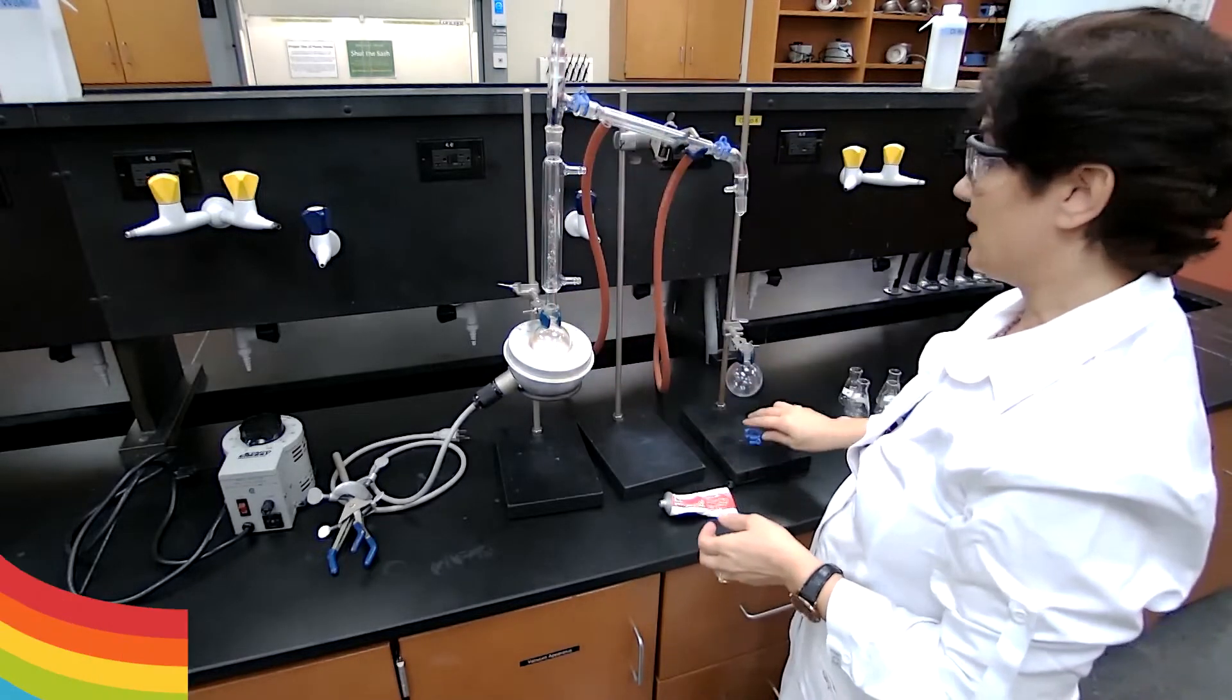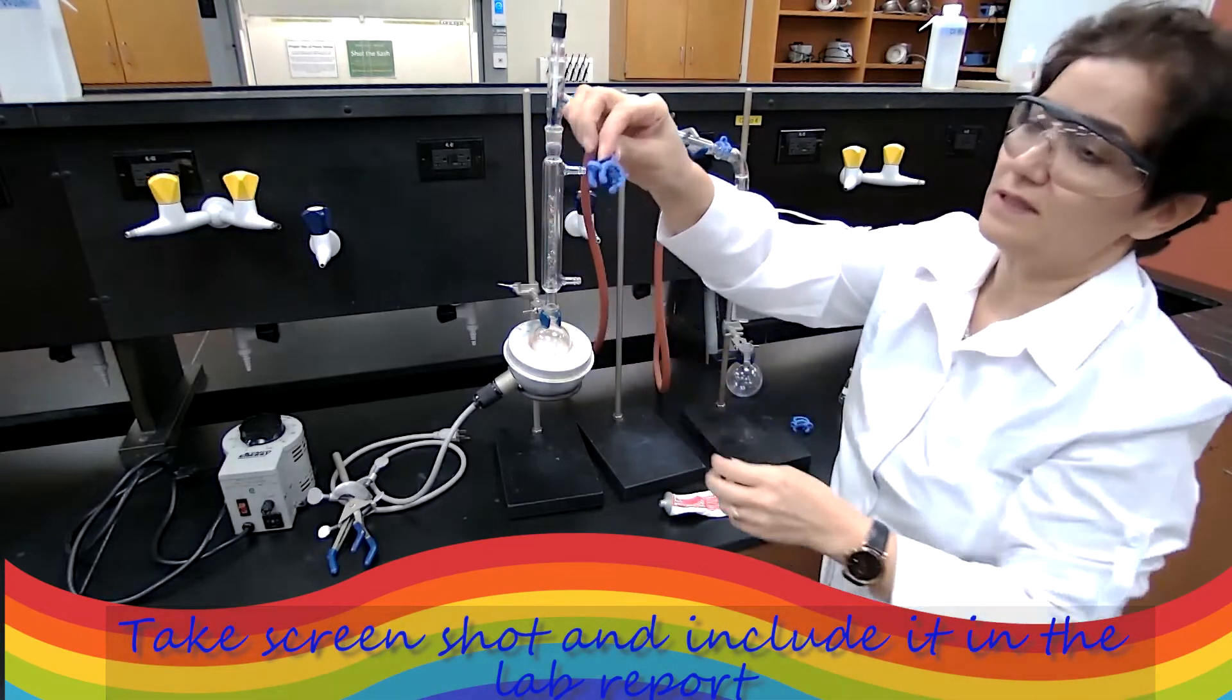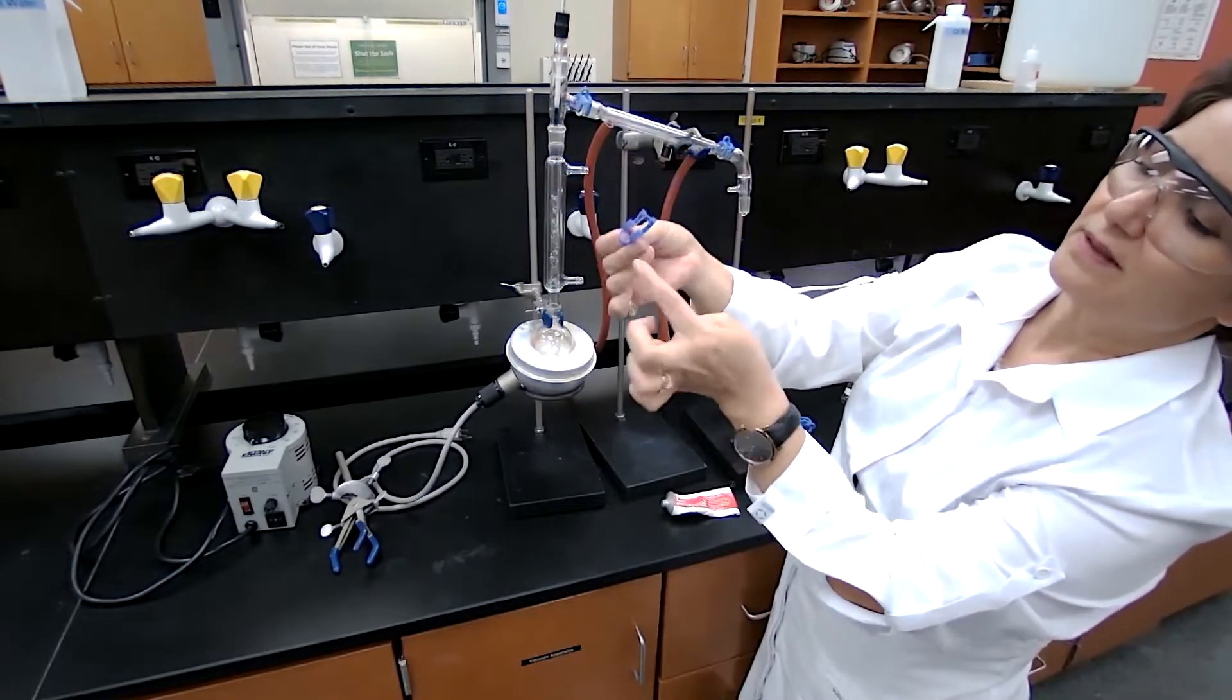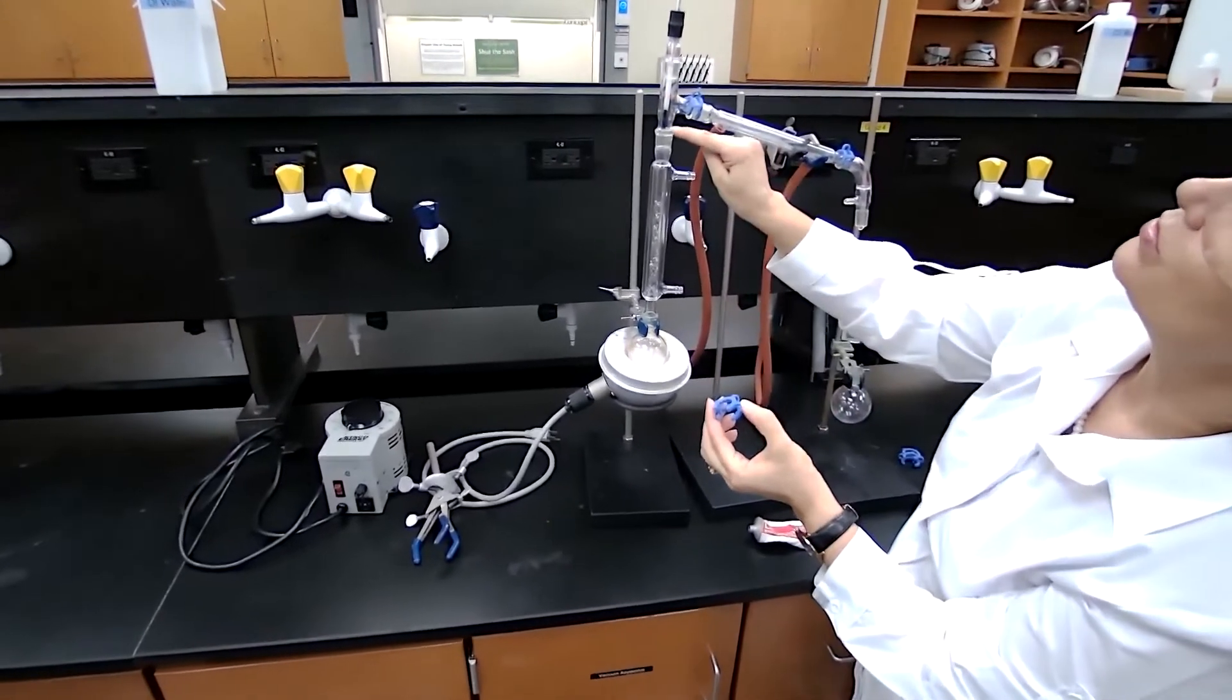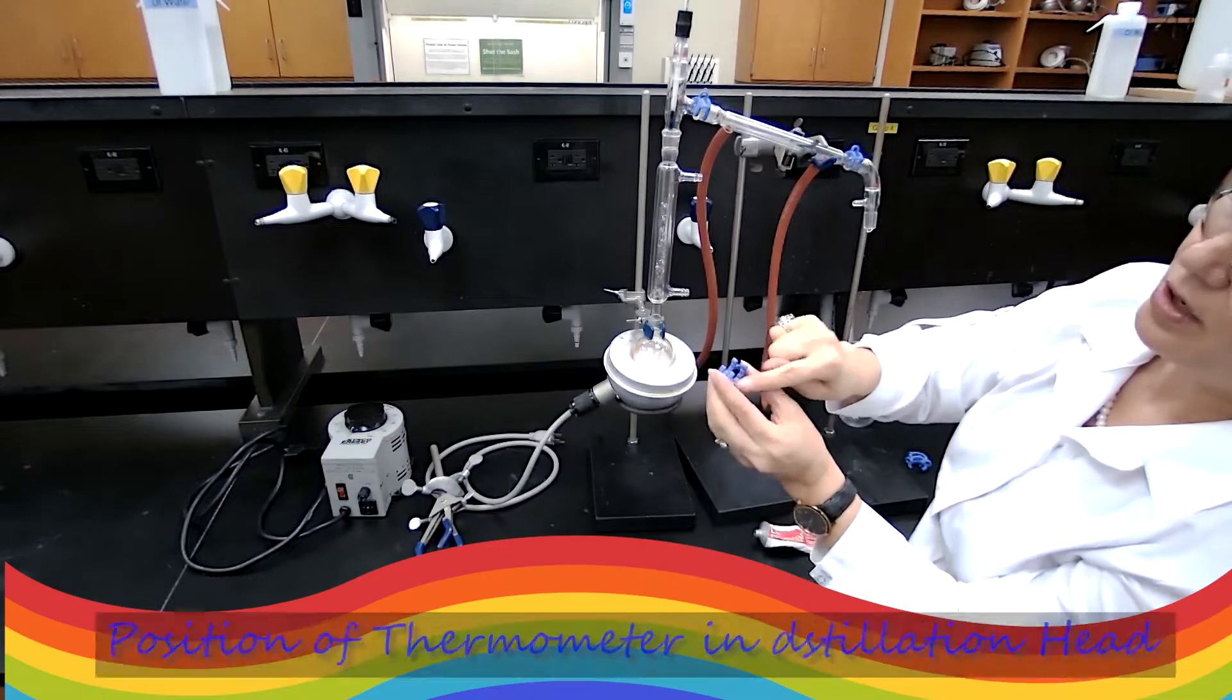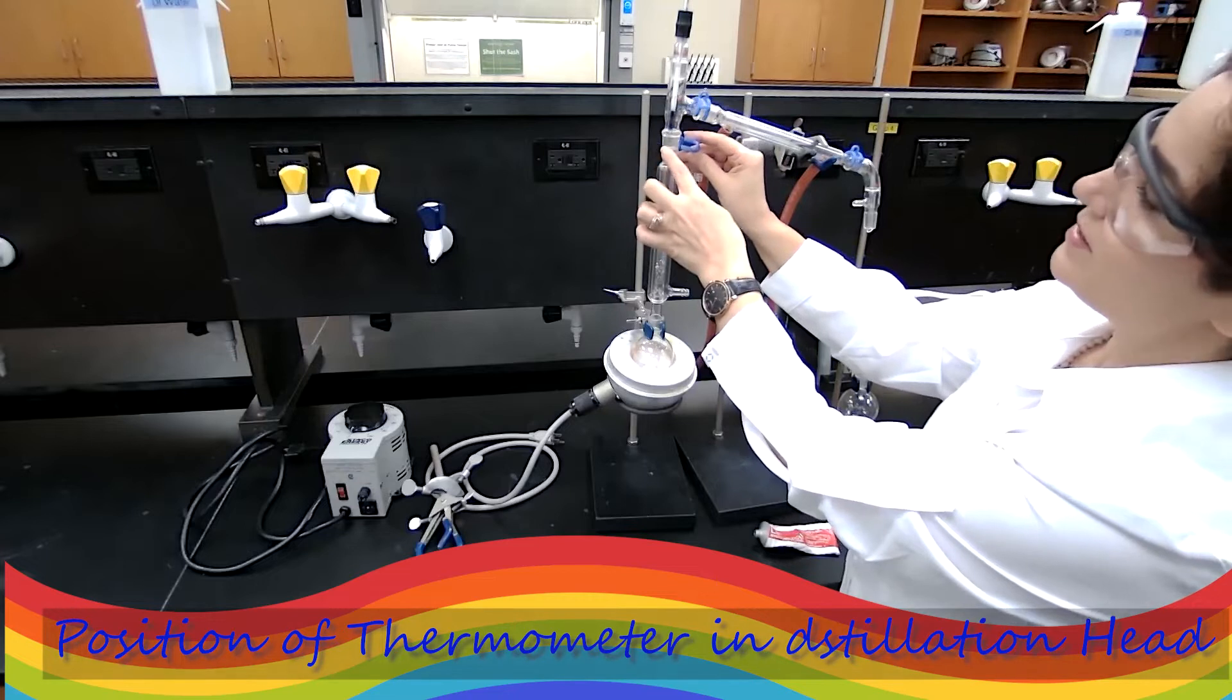Whenever you have two glass joints, you use the keck clamp which has a small ring and a large ring. The small ring should go to the thin side of the glass joint and the large one should go to the thicker part of the glass joint.